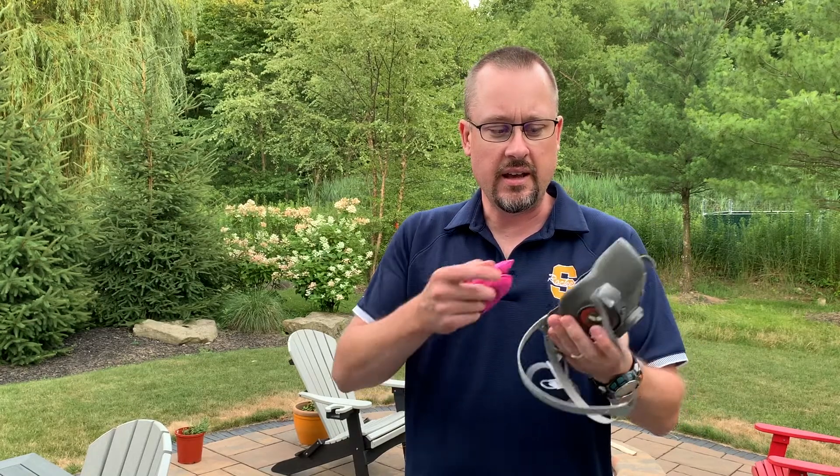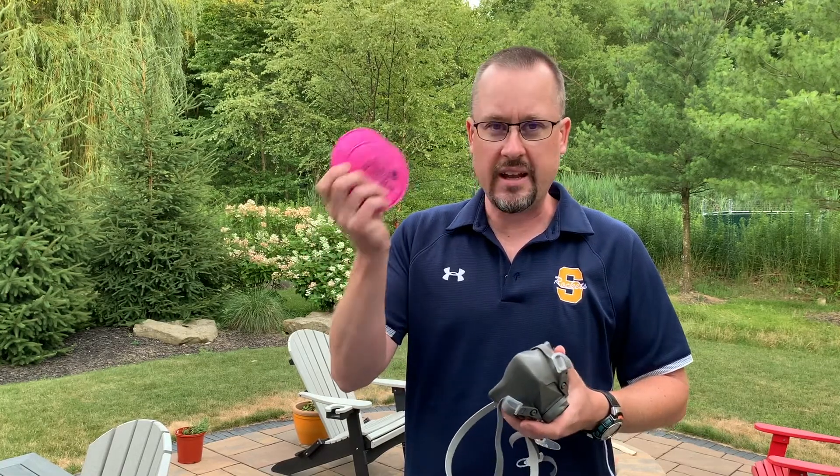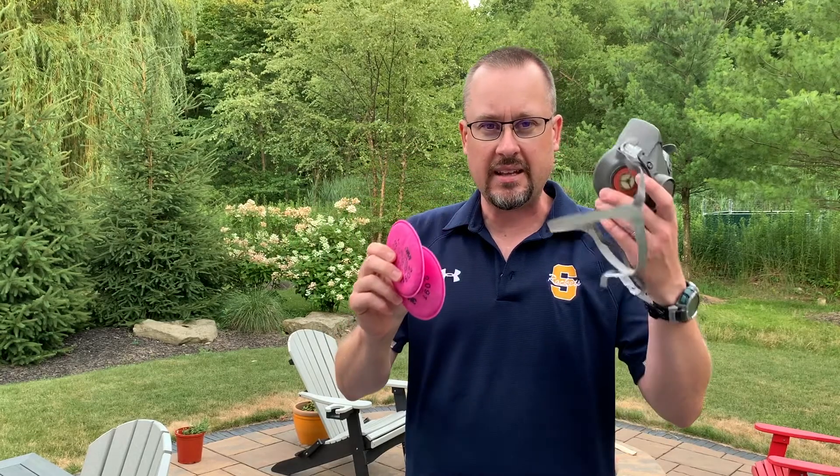You'll get a 6000 series respirator from 3M — this is the legit, the real deal. It has a silicone seal, it seals very tight to your face, should be no problem. And then with it you're going to get some P100 filters. I know they look crazy in pink. They attach to the mask.